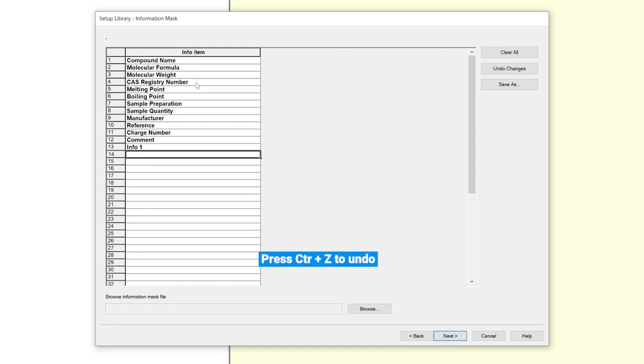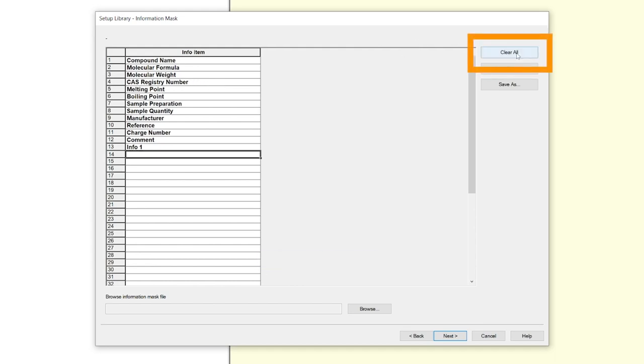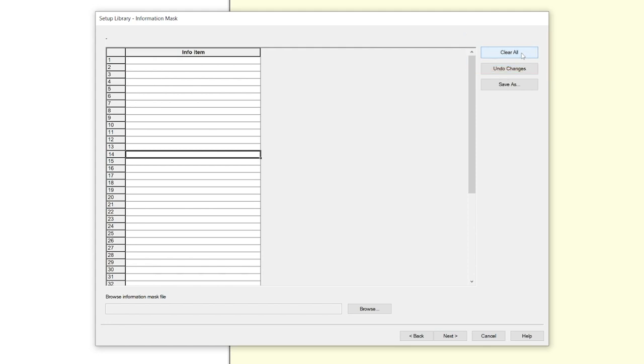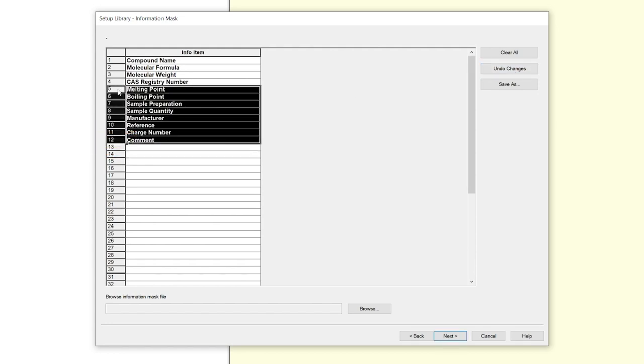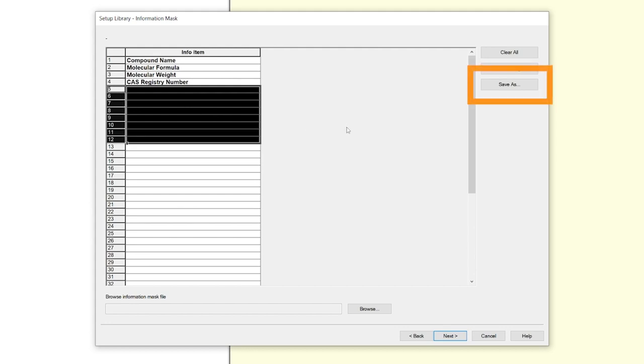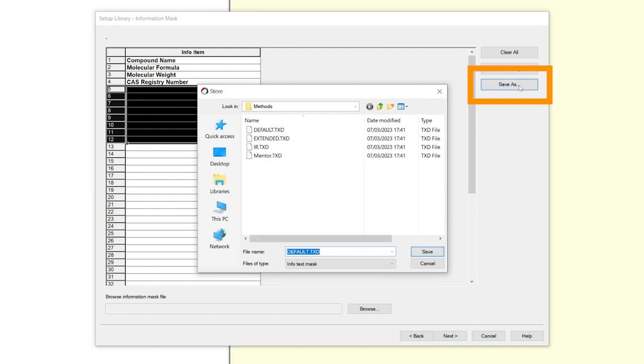If you want to undo your last change, press Ctrl+Z. If you want to change the whole table, you can use the clear all button on the right. If you want to reset all your changes, press undo changes. If you want to delete only a few, select the number at the left and press delete. If you want to save your information mask as a preset for later, use save as.